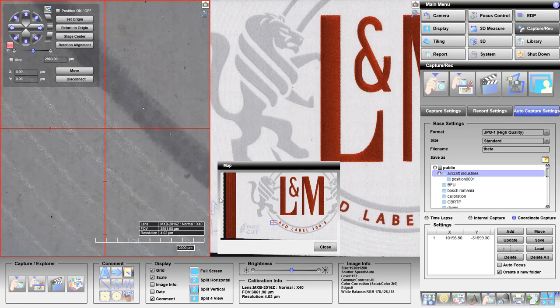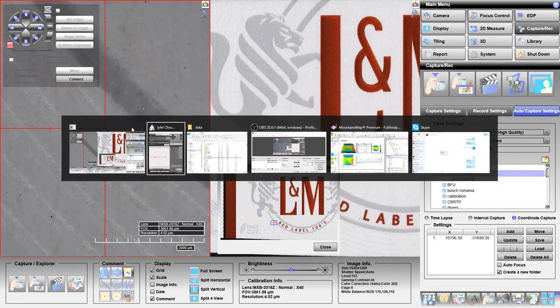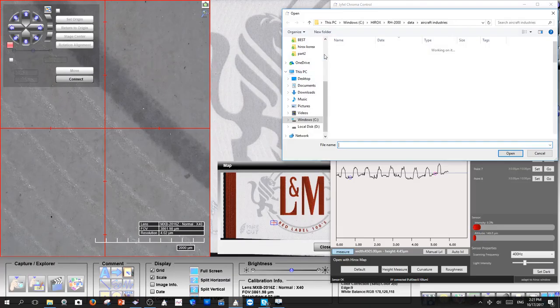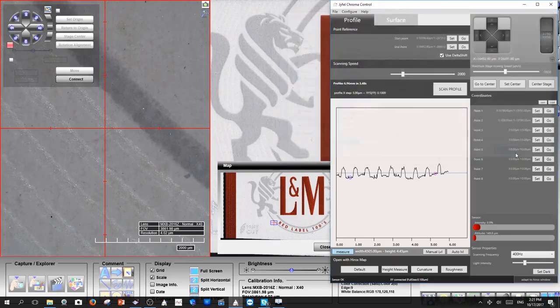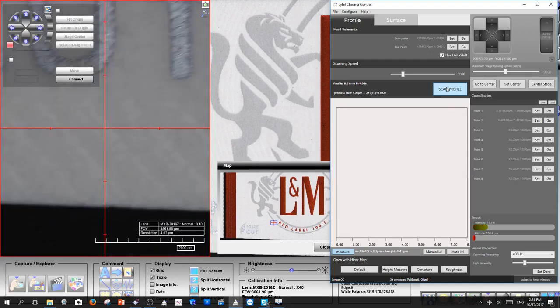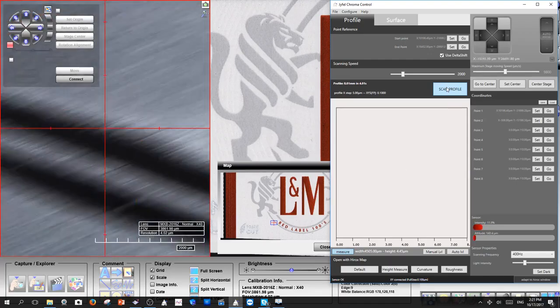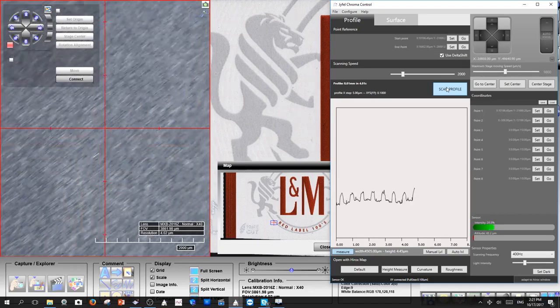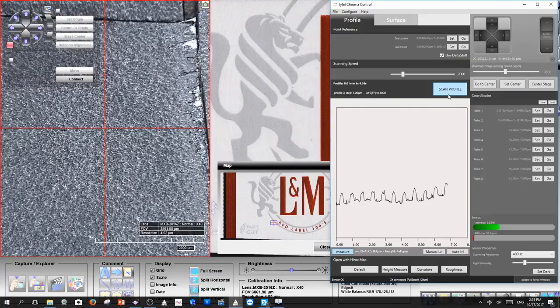Okay, and now I will go to the nanopoint scanner, and this is my ends, and I will load the point number 1. I will go there, choose this as my starting point, and now I will press on scan profile. So now the sample goes under the nanopoint scanner, and here we can directly scan the surface.